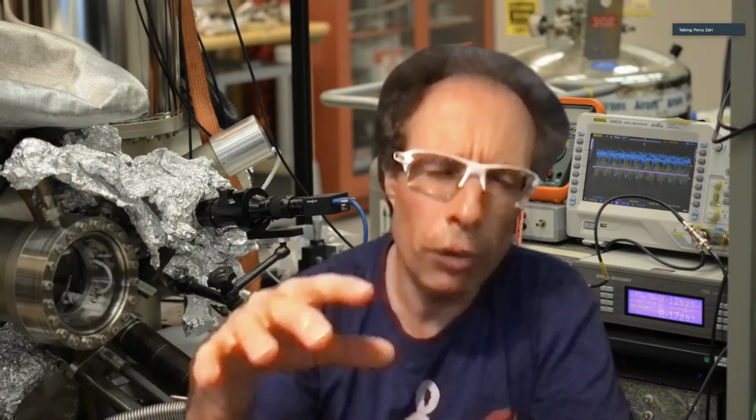In the other sense, I'm a lot about instrumentation. I'm optimizing the detection, imaging, software, electronics, pretty much everything. The whole machine is home built, and there's always something new, some newer technology comes up, some new ideas, a new measurement method. You want to look at different properties, you need to tune the measurement in a different way. So there's always something new coming on. So that is a cool thing. It's continuously evolving.